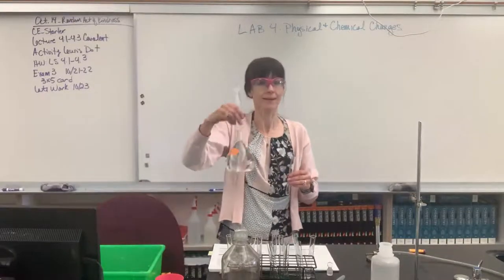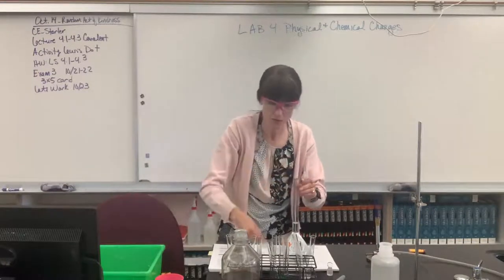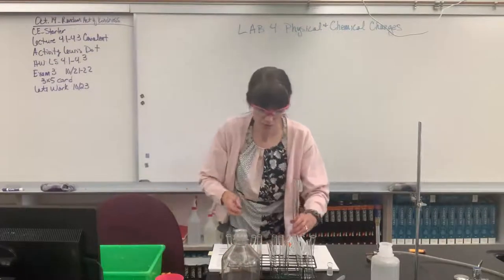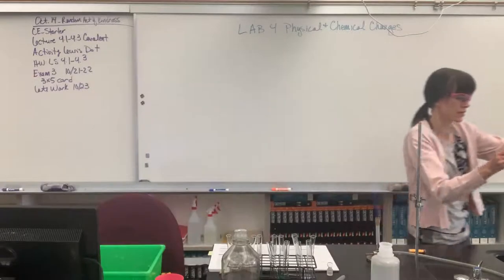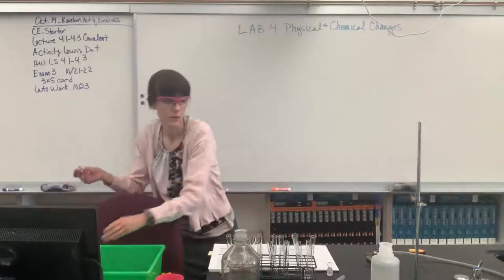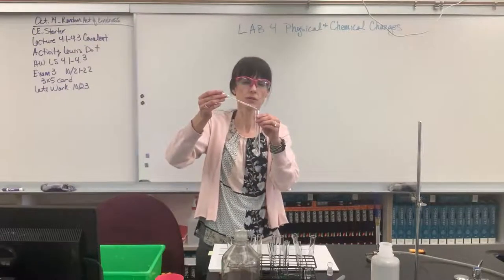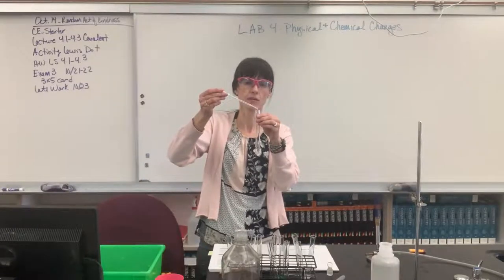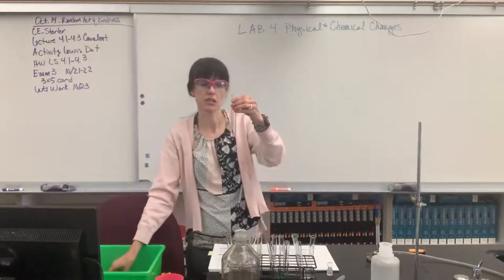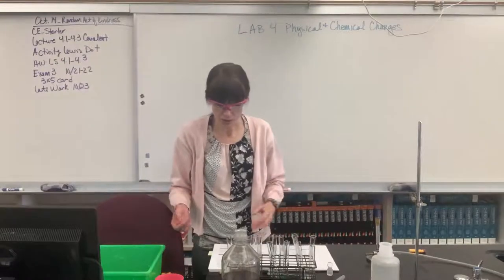Here is my 0.1 molar calcium nitrate. So let's get a new pipette. We are supposed to add to this 6 drops. Okay, 6 drops. So let me bring this over the sink, you guys. All right, so let's add our 6 drops of calcium nitrate into the sodium bicarbonate. 1, 2, 3, 4, 6. Big fat nothing. It's just clear. Let's go ahead and record that. No reaction. It's still just clear.